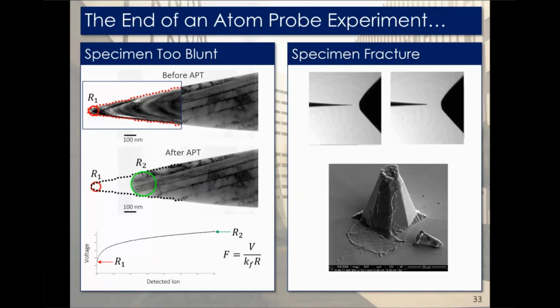There's a few different theories of exactly what causes atom probe samples to fracture. The most common one is that basically you'll have brittle fracture due to the electrostatic stress on a sample. That'll be followed by then a sharp feature which can lead to a large ion current and arc backwards from the local electrode, which then melts the tip and destroys it instantly. As we see here, the image I have on the bottom right, where you can see what remains of a silicon micropost after a sample fracture. You see that it's essentially been melted and nuked by this arc.